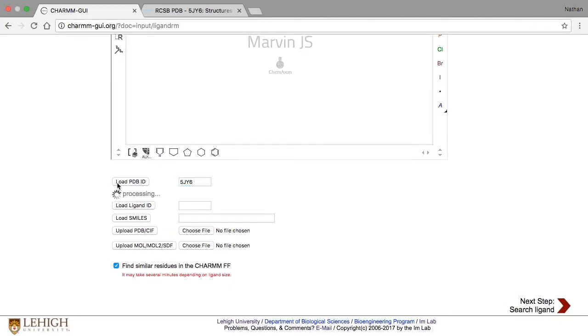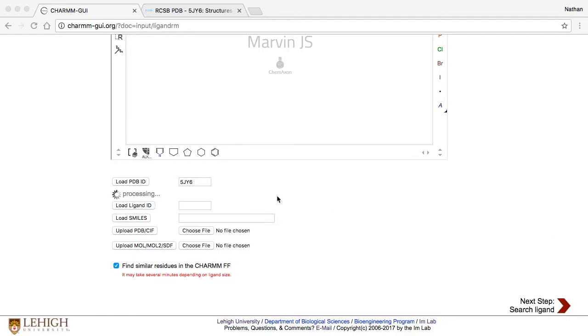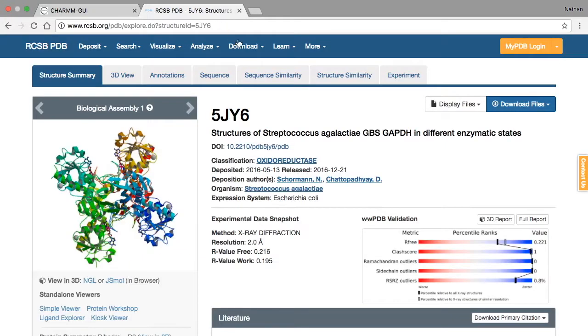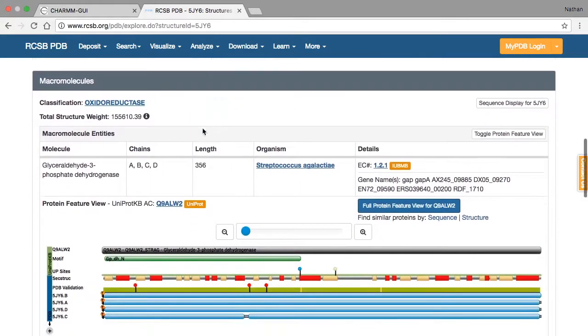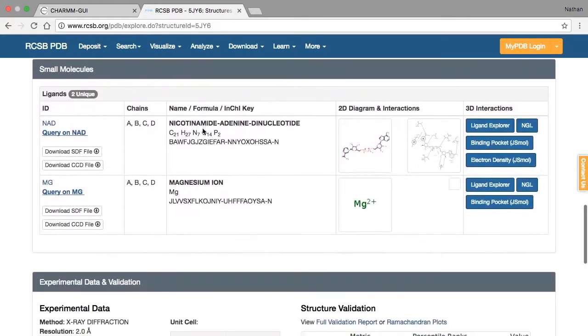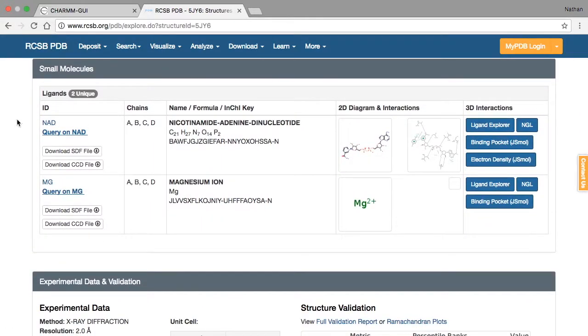LigandReader and Modeler will then search the corresponding entry in RCSB for a list of ligands. To get an idea of what's happening, let's look at the RCSB page for 5JY6. Scrolling down to the Small Molecules section, we see two entries: NAD and MG.